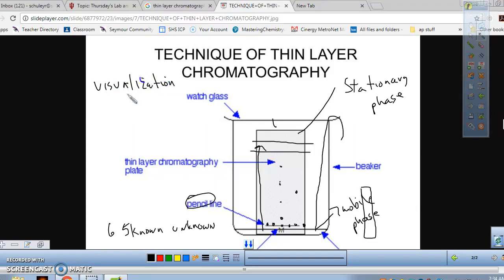are going to be, you're going to use ultraviolet light. It turns out that this chemical that's painted on this paper has been impregnated with a chemical that will glow under ultraviolet light. So we'll have a little ultraviolet light that you can shine over the top of it, and then you'll be able to see some, if not most, of your dots. What you want to do, because they're invisible, is take your pencil and draw a circle around all your dots that you see. And then turn off the ultraviolet light, and then you'll see those dots.